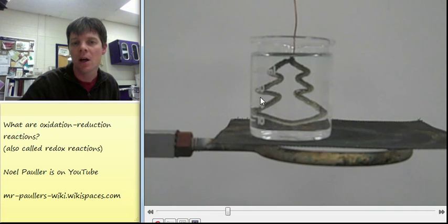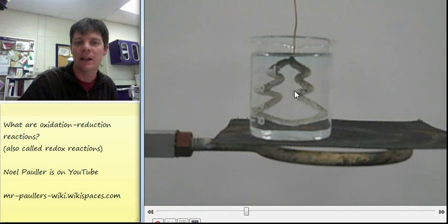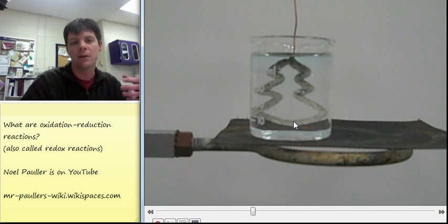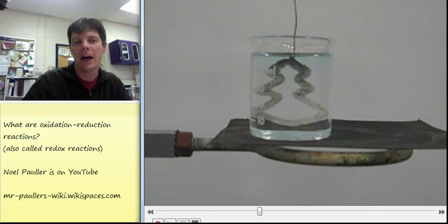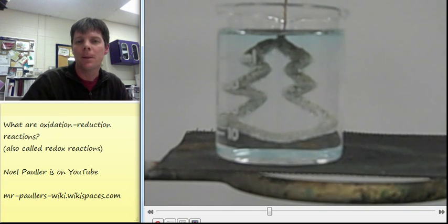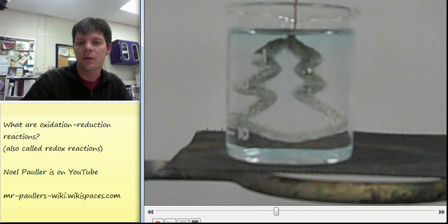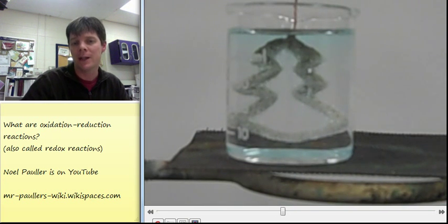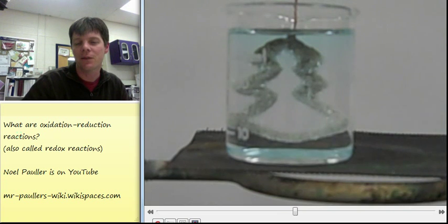We can see the precipitation of solid silver along the outline of the tree. The other thing that I want you to notice is that the liquid inside of the beaker is turning kind of a blue color. This is because of the formation of the copper nitrate solution that will produce a blue tint. So we're seeing really nice evidence of this chemical change.